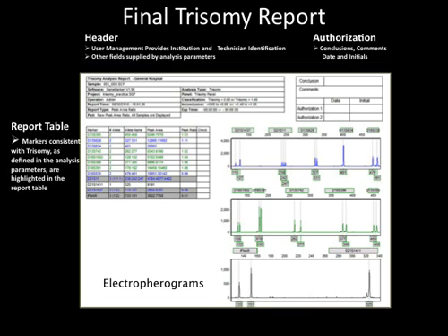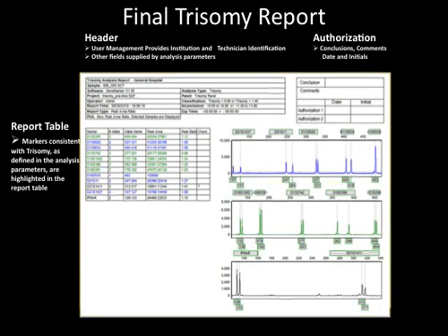The other fields in the header are supplied by the analysis parameters. The report table contains the marker name, number of alleles, allele names and peak area or height if height was selected in the trisomy settings box, peak ratio, and a check column. If the peak ratios are within the trisomy range, the line will be highlighted — as seen in this example for sample 51 — with peak ratios in the trisomy range for loci D21S11, D21S1437, and IFNAR. If the peak is within the inconclusive range, a question mark will be displayed in the check column of the report table, as seen in this example for sample 066.